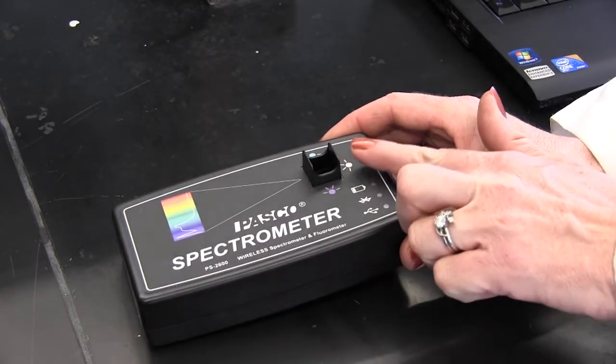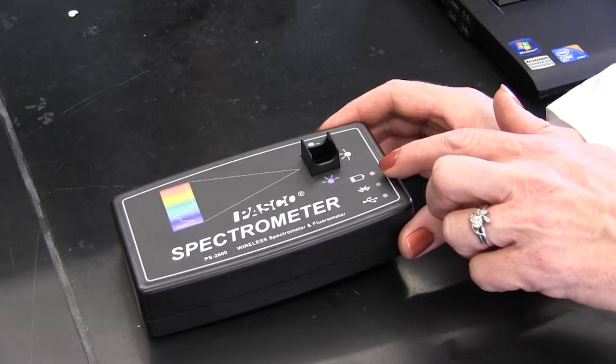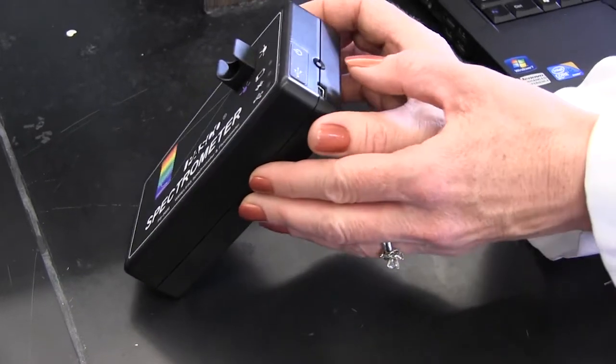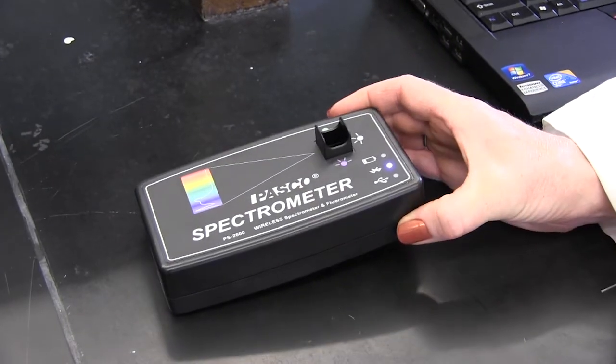It has an opening for a cuvette or for the fiber optic probe and you'll notice that there are three LEDs on the front face. In order to turn it on, you press and hold the power button until you see the LEDs start to illuminate.